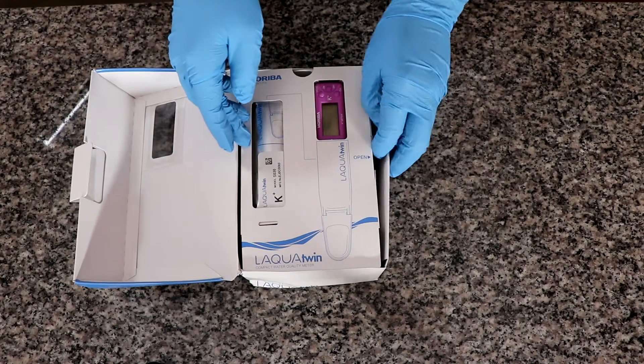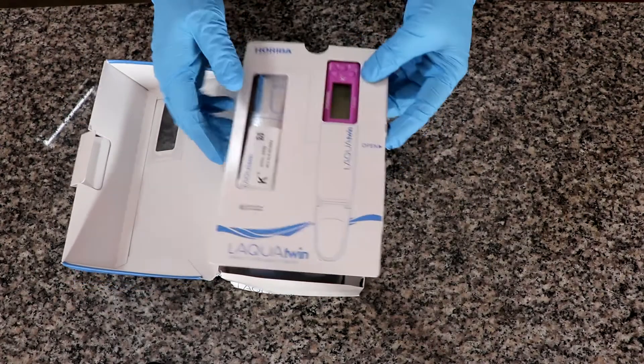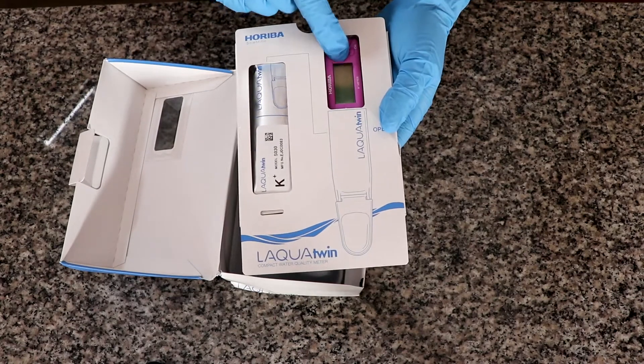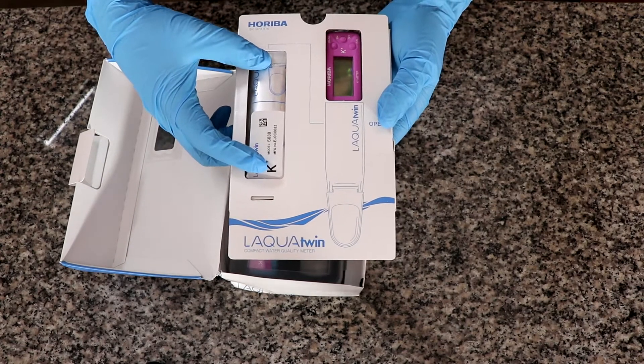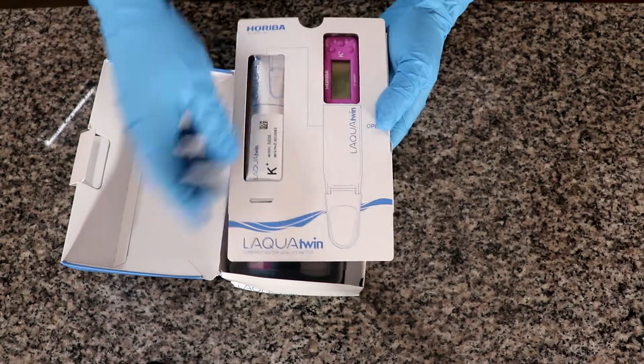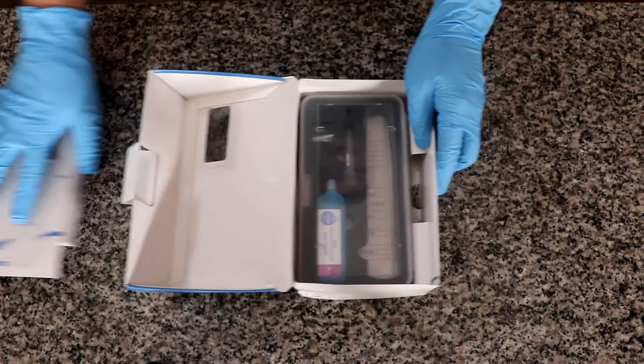First of all we are getting the electronic unit and this is where the ion selective electrode actually is, which is this part here. I'm going to set this apart for the moment.